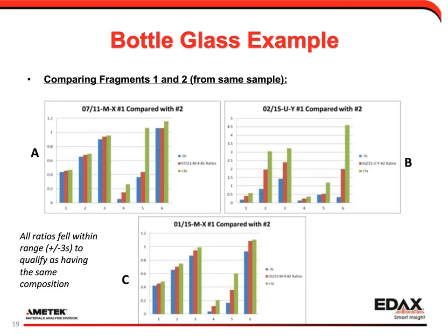Basically between samples A, B, and C, we see that in each case, fragment 2 always falls within the ranges set by fragment 1. So it confirms that, yes, they have the same composition, which is something that we already knew, and it successfully confirms.